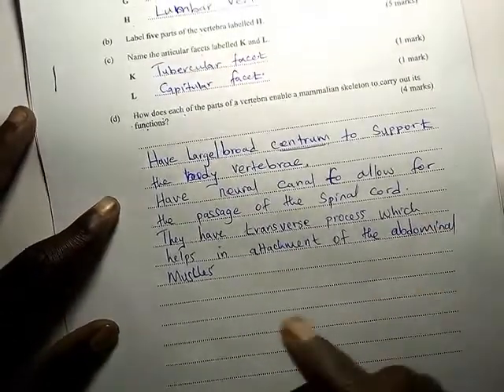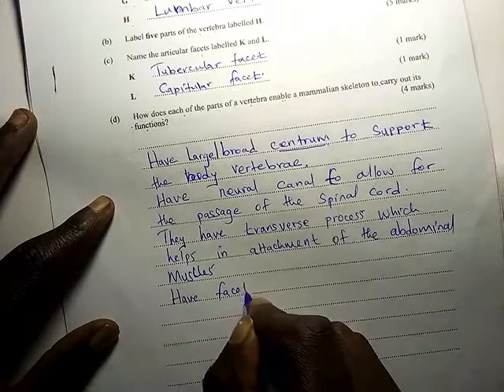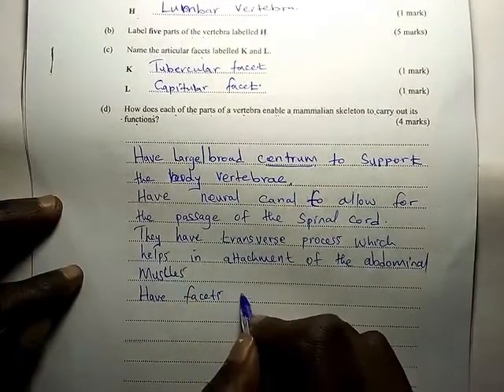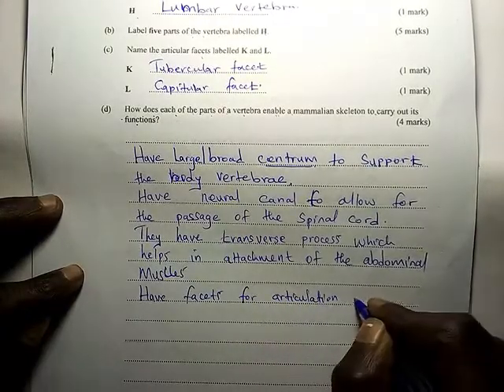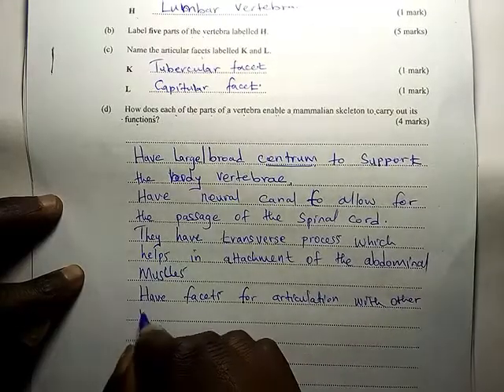Now we go and see that they have facets, facets for articulation with other vertebrae.